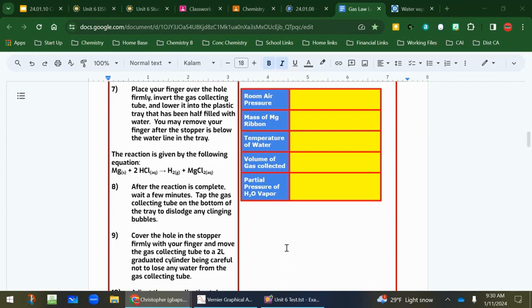Okay? So that is the last step that we have to do. And this is where you read the volume on here. Now again, when you're reading volume, there are markings on here for 10, 11, 12, 13. But there are also markings between 10 and 11, so you better figure out if those are tenths or not. Because you need to report your answer as accurately and as precisely as possible.